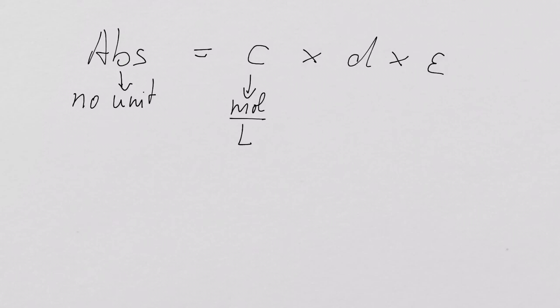It could. Be careful with nanometers, because you can use nanometers, absolutely right, there's nothing wrong with it. But if I put down nanometers, and we talked about wavelengths of 600 nanometers, for example, then I bet somebody will now wake up and say, oh, nanometers, oh, I have to put in the wavelengths. Right? You know what I mean?